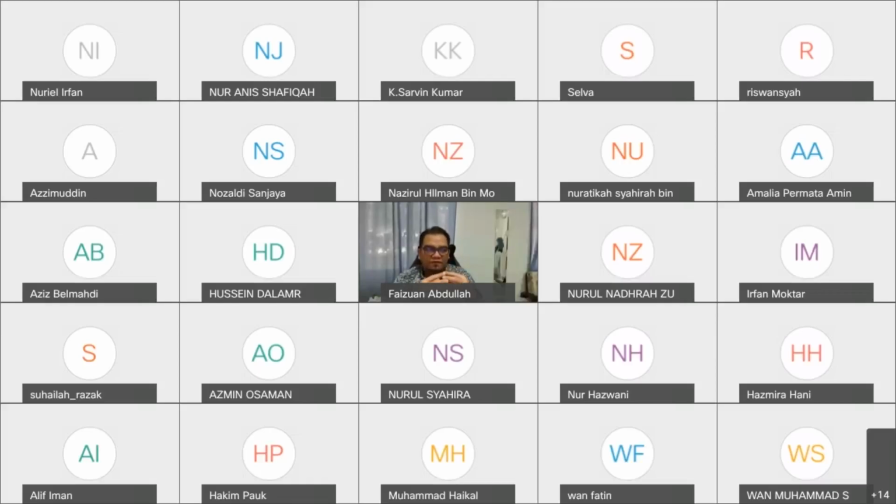Okay, we have learned in the video previously that I have uploaded on YouTube, the e-learning, about the introduction of spectroscopy. The basic thing about spectroscopy is it is a method that we use to analyze our analyte. Spectroscopy is based on what? The word spectrum, right? The light.